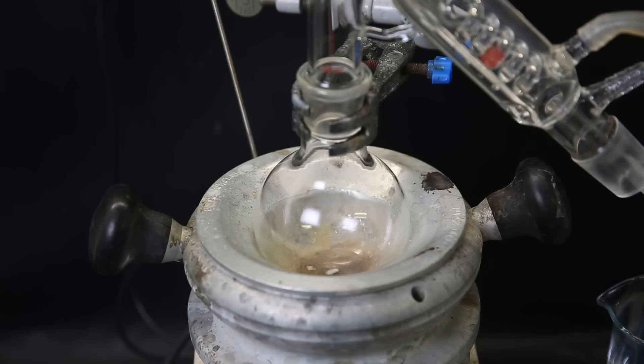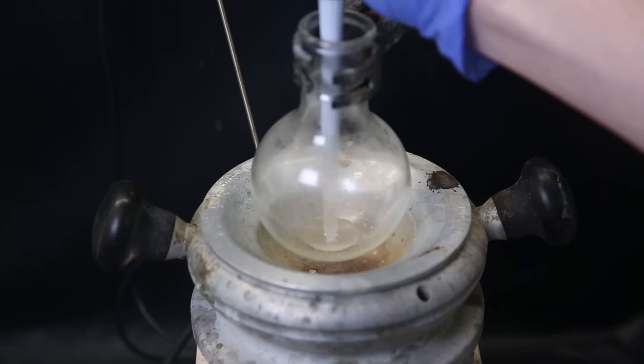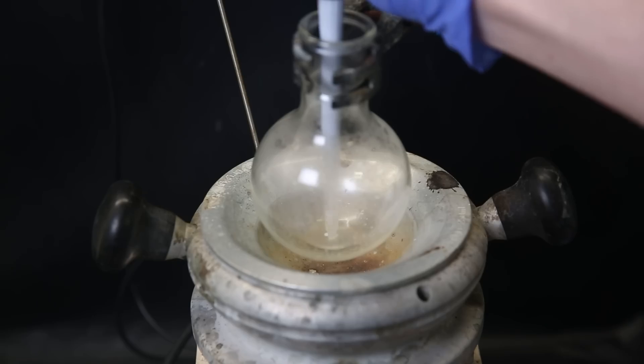I add a tiny stir bar and then distill off all of the ether. When all the ether is gone, some liquid is left behind that should be benzaldehyde. I pipette it all into a vial and it seems to be a bit cloudy, possibly from some water that is remaining.